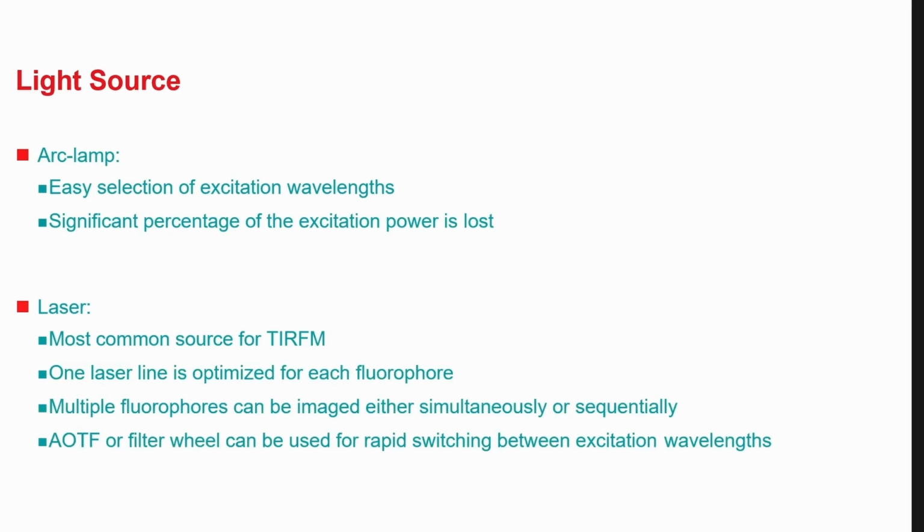The alignment is not trivial because you have to set up the laser beam at an angle. So basically, during the setup or the alignment, there is an open laser beam in the lab. So this is not done in the presence of microscope users. It's not allowed to be done by anybody else except the microscope manager, him or herself.